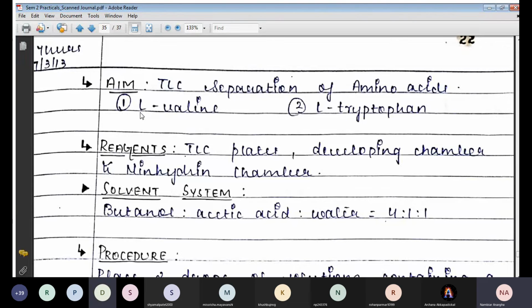The polarized light is rotated by the compound, and it means it is denoted L. Sorry, I cannot hear you, Devashi. Can you please repeat it again? In a polarimeter, where we put amino acids, they rotate the polarized light.